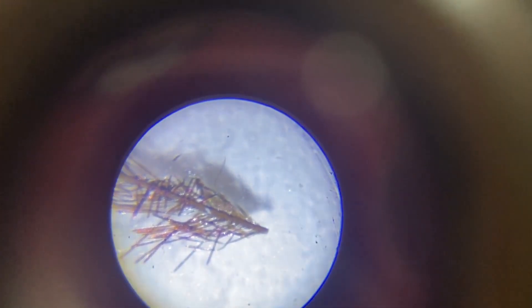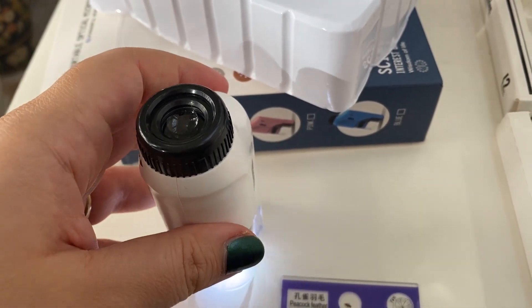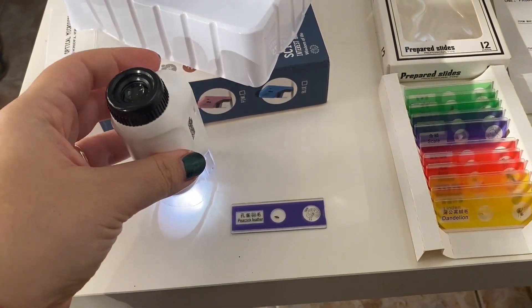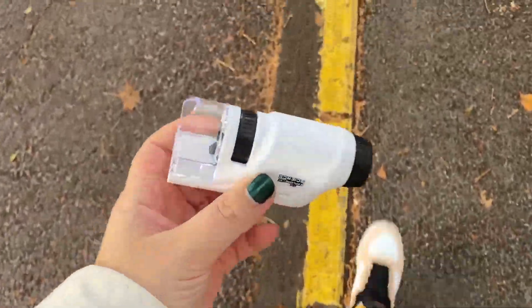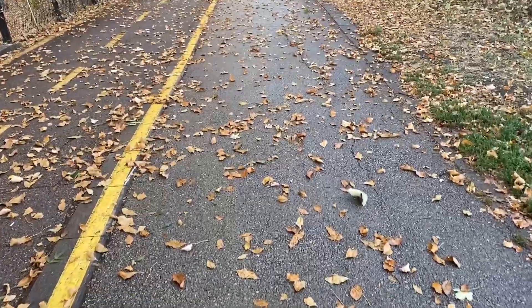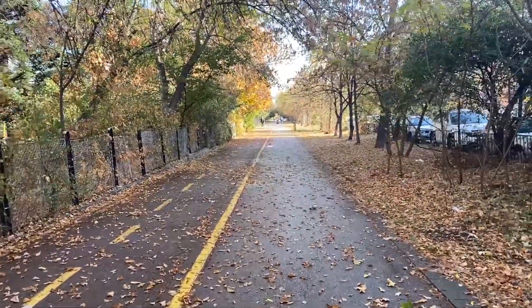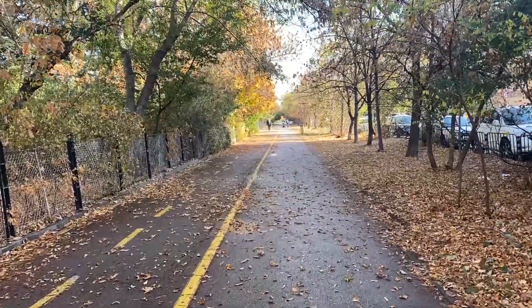That's really nice, you can actually see it from the camera. I think we've done enough testing with the prepared samples. Let's go outside and explore the actual world with this. It's a bit wet — I guess it's been raining while I was asleep. Still, I don't think this will be a problem for the microscope, so I'm going to the park to gather some leaf samples.